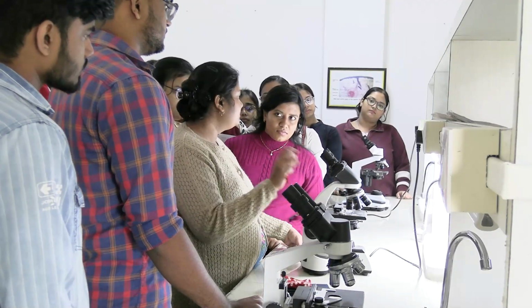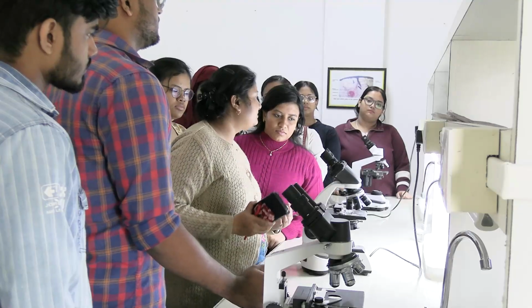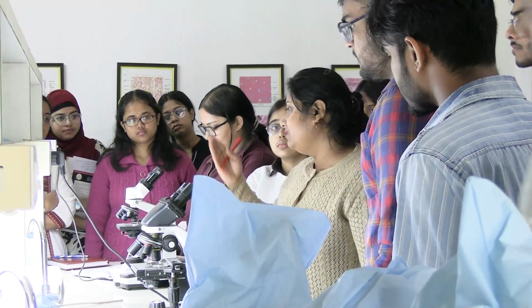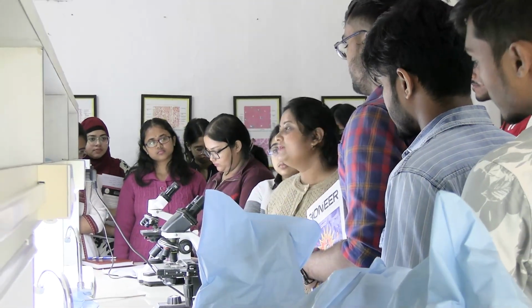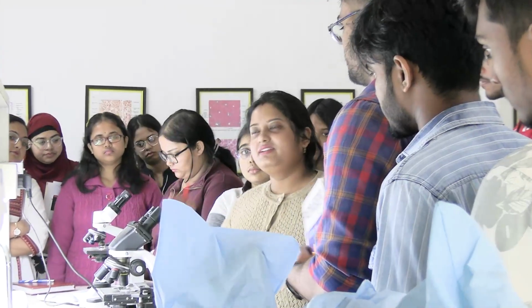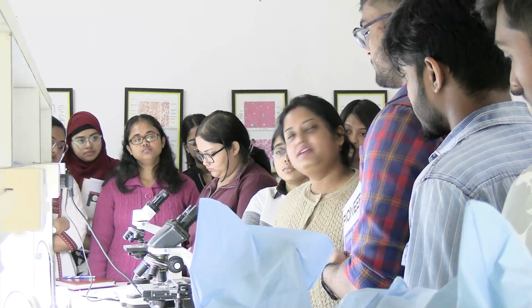So if you will be given in exam, you can be given this slide. Okay, this is specific features of appendix. You see the specific features of the lining epithelium. Okay, lined by simple columnar epithelium with numerous goblet cells, numerous white dots. Every alternate cell is the goblet cell. Okay, you see, and middle white part is the lumen.